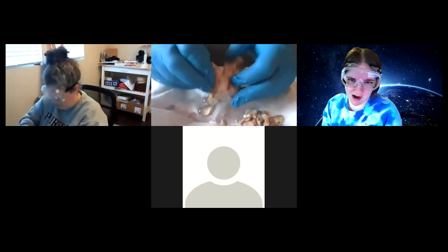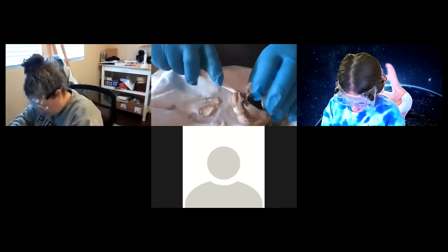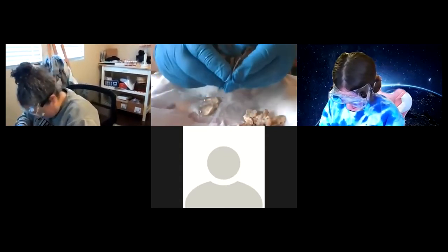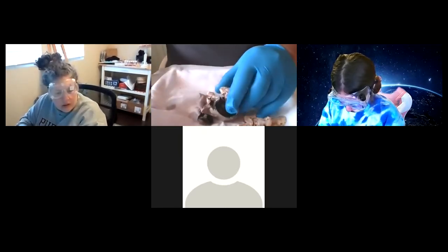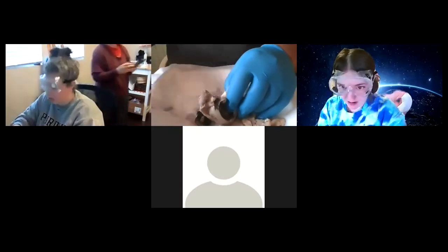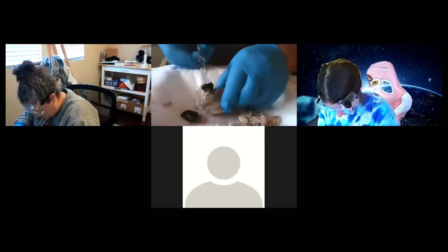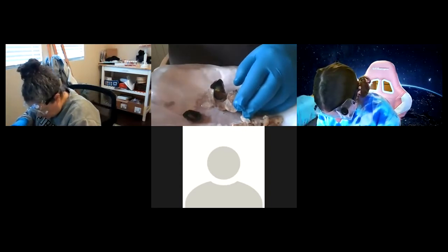Where did you start cutting from? From that opening, from the front right here. Let me try the scalpel. Be careful — always cut away from your fingers. Trying to keep this as intact as possible, but it's not easy. The scissors that came with the kit aren't the sharpest, but I want to use everything you guys are using.